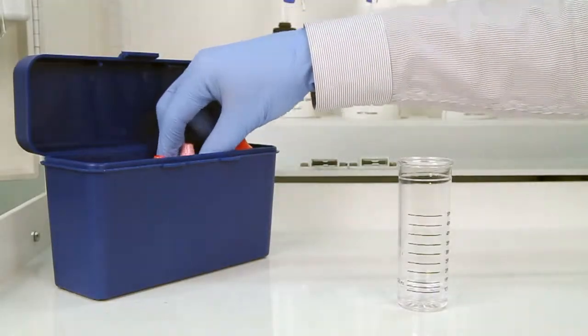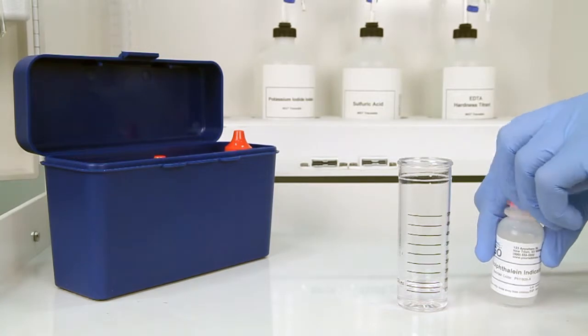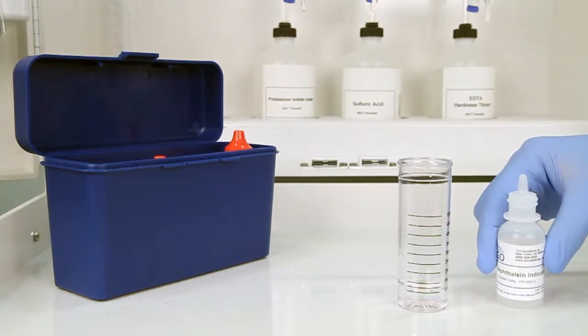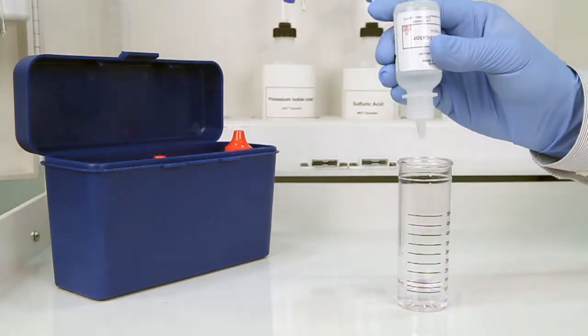Once you have collected an accurate sample, the next step is to add three drops of phenolphthalein indicator. The bottle contains a dropper tip, so it's important to hold the bottle vertically to get a consistent drop size.